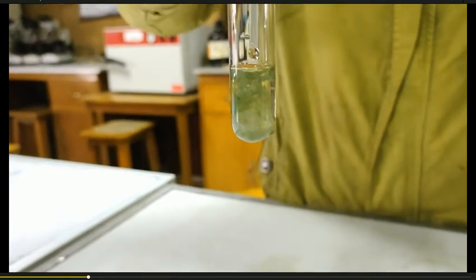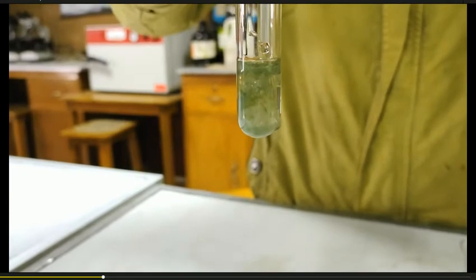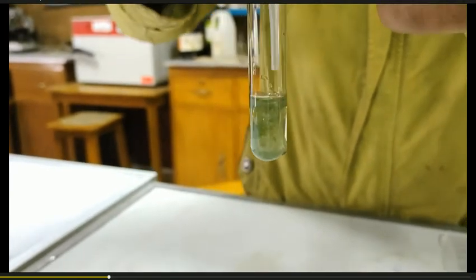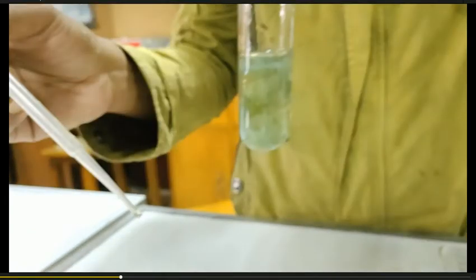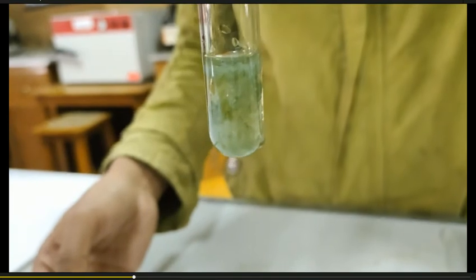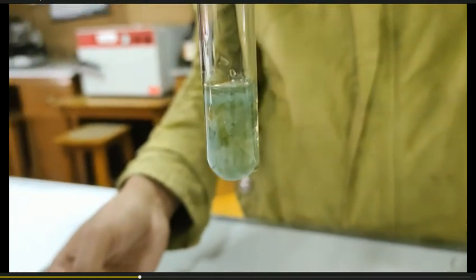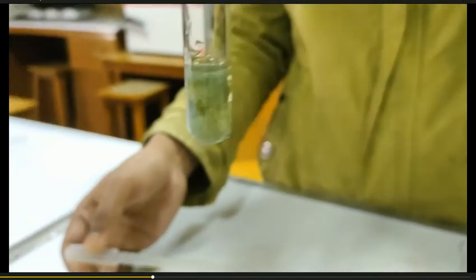So this is indicative of the presence of ferrous ion, and the PPT is insoluble in excess amount of alkali. If we add excess amount of alkali, the PPT will not dissolve, and this is prominent from this addition, that as the amount of sodium hydroxide increases, the PPT also increases. That means the PPT is not going to dissolve with the excess amount of alkali.